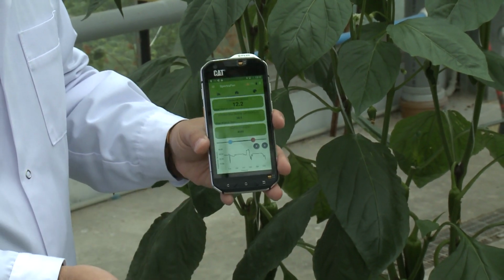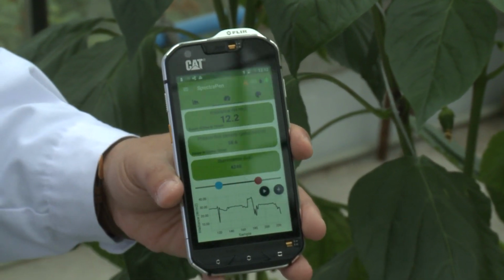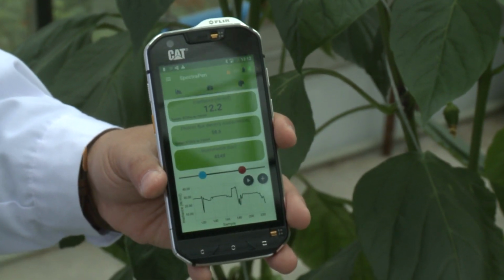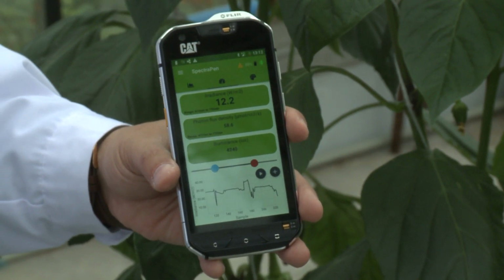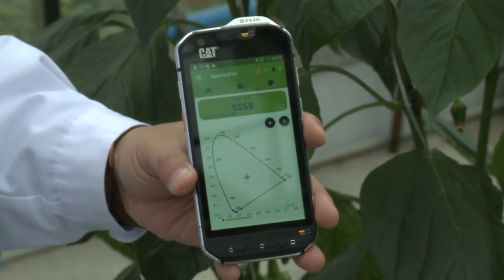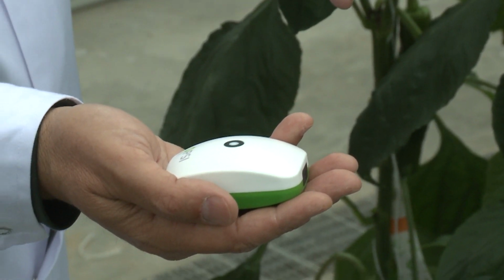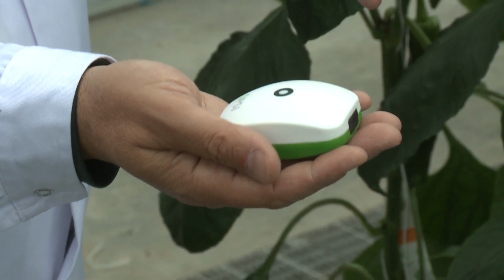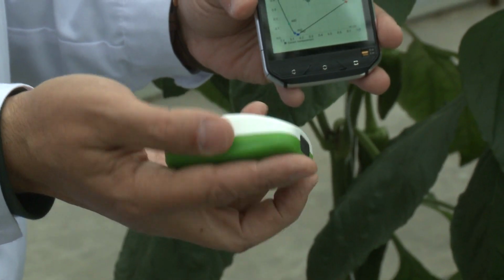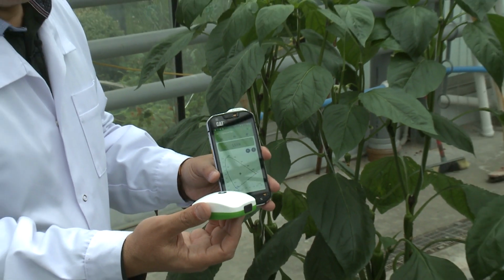We can see here on this screen the 3 units which are measuring the light intensity, and at the same time we can see the light quality curve. On the other hand, we can get the colors of this light analysis directly on the screen by the use of such small portable instruments, which could be handheld or could be fitted on a tripod or something similar to that.